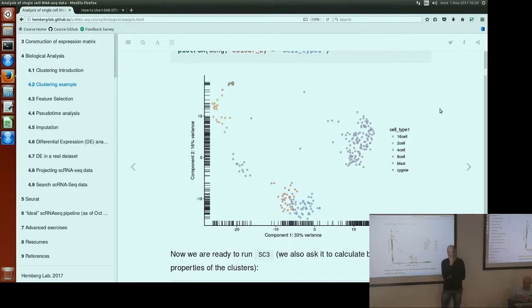So I think the question is about rare cell types, right? Very small. When you have a data set with lots of cells, but your cell type consists of only a few cells, like maybe two or three. There are some algorithms which deal exactly with this problem. The ones that I'm presenting here are more general, so they would try to separate things into large groups. As I said, there is no universal clustering algorithm. Depending on the question that you have, depending on your data set, you sometimes would use a different algorithm, which is more specific to your purposes.